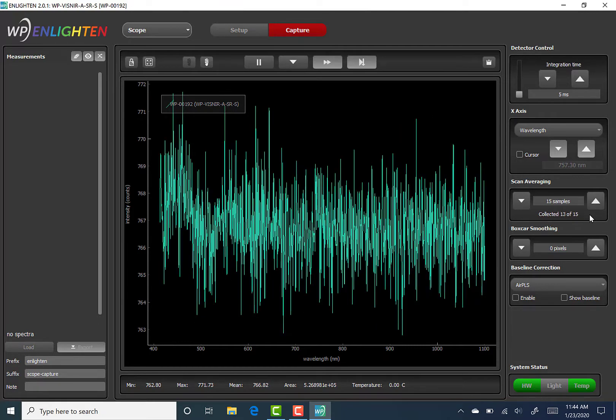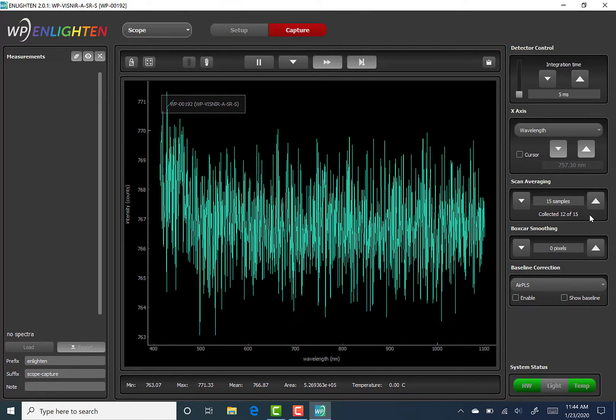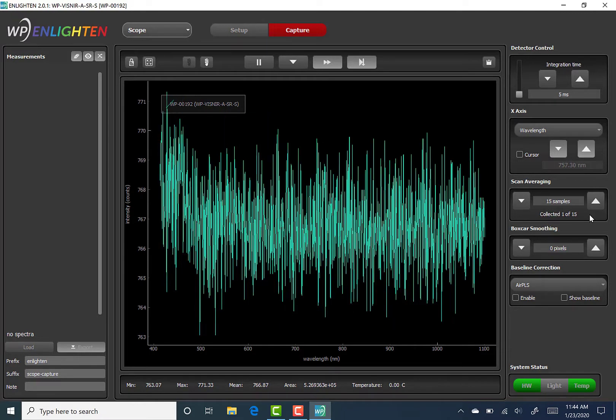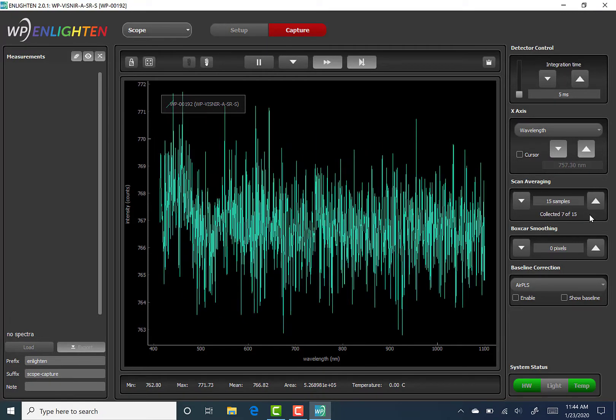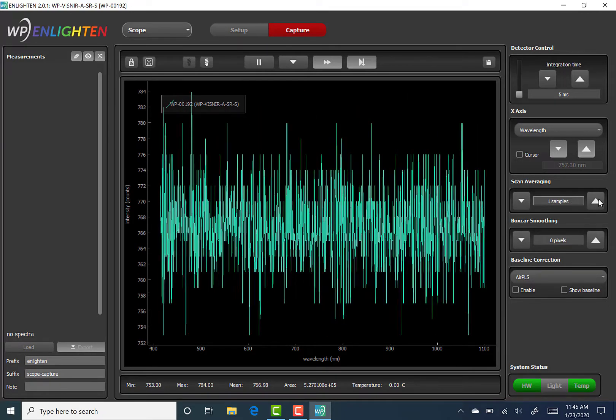Please be aware that when storing dark and/or reference measurements, they will be stored according to the post-processing settings, such as scan averaging and boxcar.